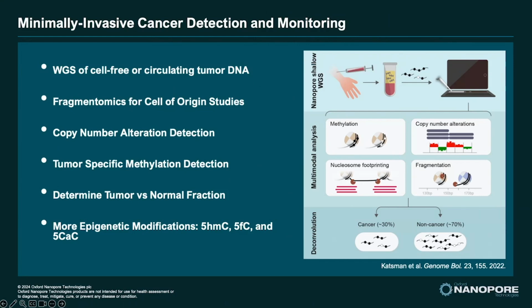And this allows for real-time results that, when coupled with ONT's fast sample preparation technology, allowed the researchers to get methylation-based tumor classifications in less than 3 hours. They also showed they could determine cell of origin using fragmentomic analysis on the ONT platform, and then further leverage that low-pass whole genome sequencing data for assessing copy number variation and even tumor fraction.